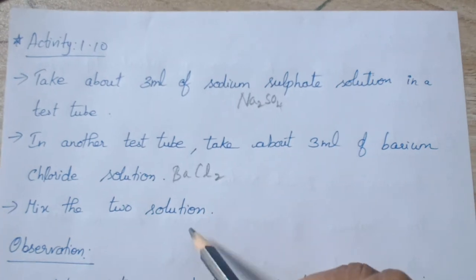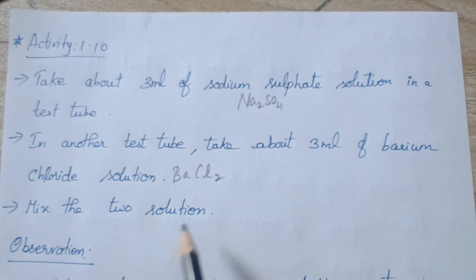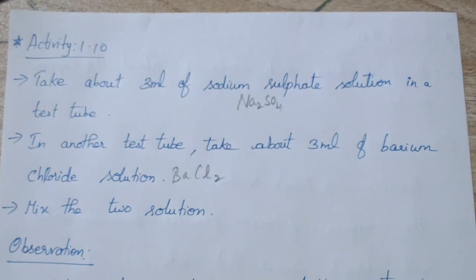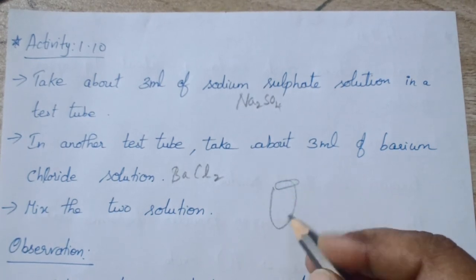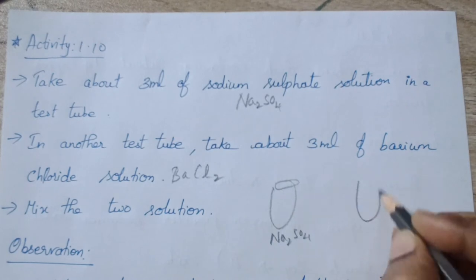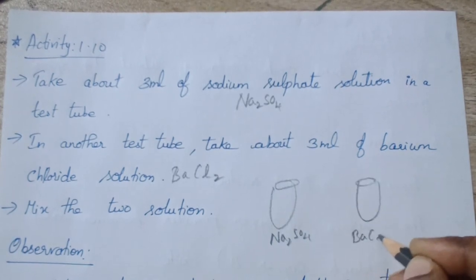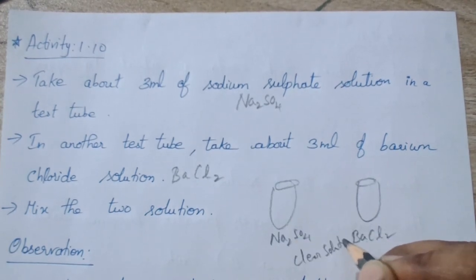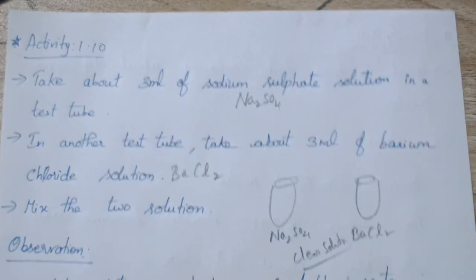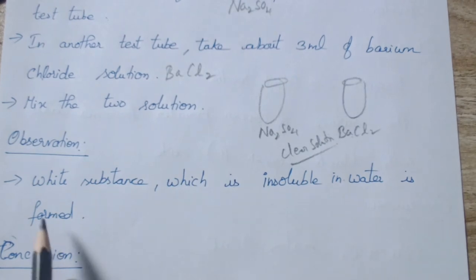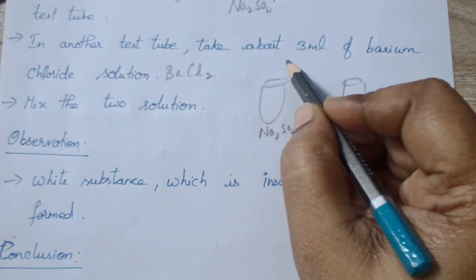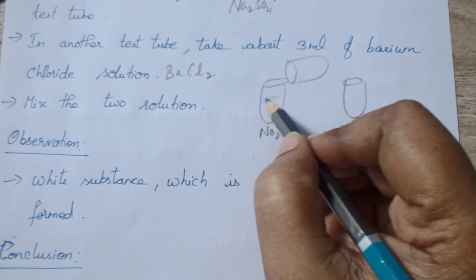Then you will get a barium chloride solution. Mix these two solutions. We are going to mix the sodium sulfate solution with the barium chloride solution. What is your observation? This test tube contains Na₂SO₄ and this test tube contains BaCl₂. These two are clear, transparent solutions. When you mix them, you will get a white substance which is insoluble in water.